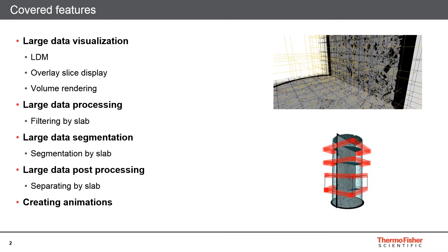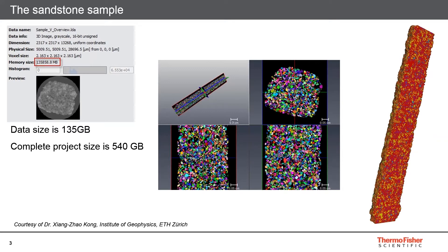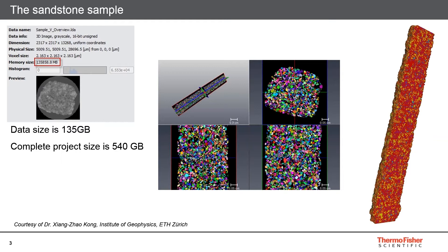Finally, you will see an animation created with the animation director. This is the sandstone sample that we will be looking at in this webinar. It's a sandstone scanned with a high resolution with the Thermo Fisher HeliScan micro CT. I would like to personally thank Dr. Kong from the ETH in Zurich for providing the rights to show the data.